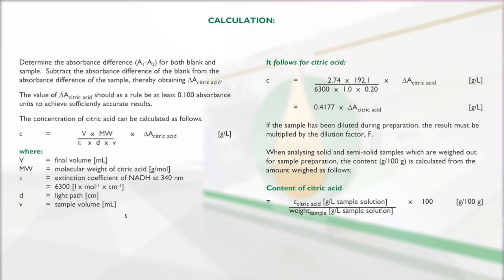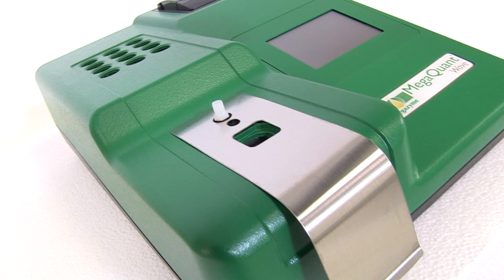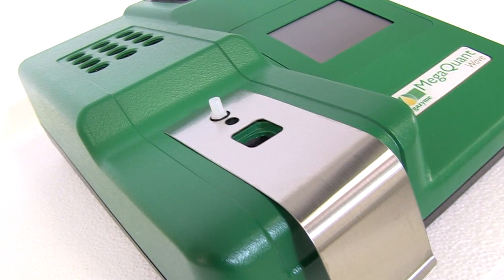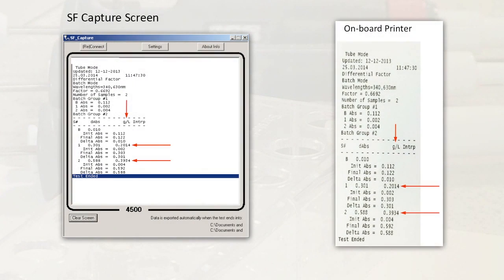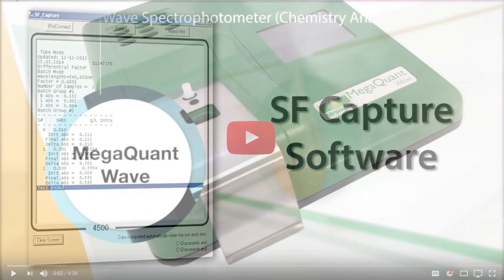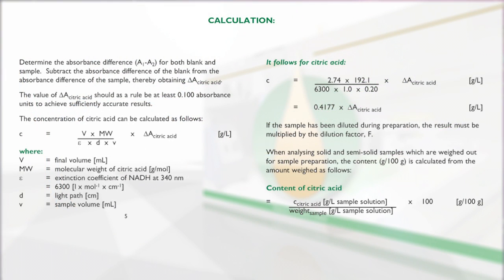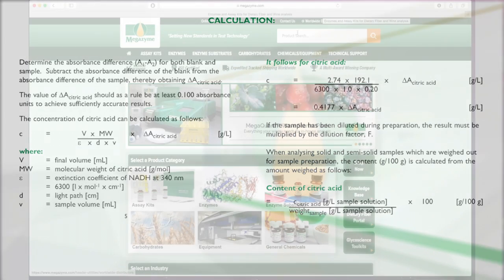in the original samples. When performing this test using the pre-installed protocol on the Megaquant Wave spectrophotometer, the results will be automatically calculated and printed via the onboard printer, or the data can be exported to a computer using the SF Capture software. Please see our Megaquant Wave video for further details. If the results output are raw absorbance values for both blank and samples, the calculations of citric acid content can be performed manually as described in the calculation section of the kit booklet.